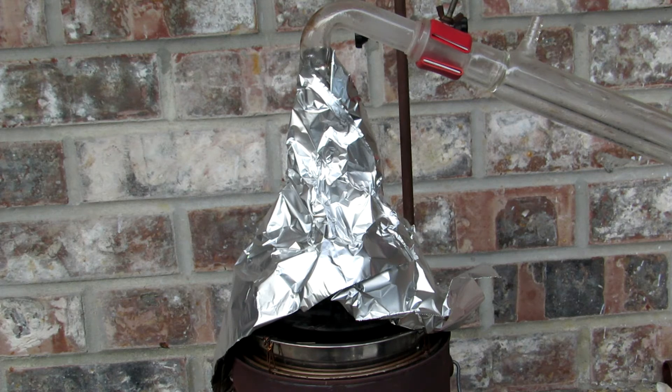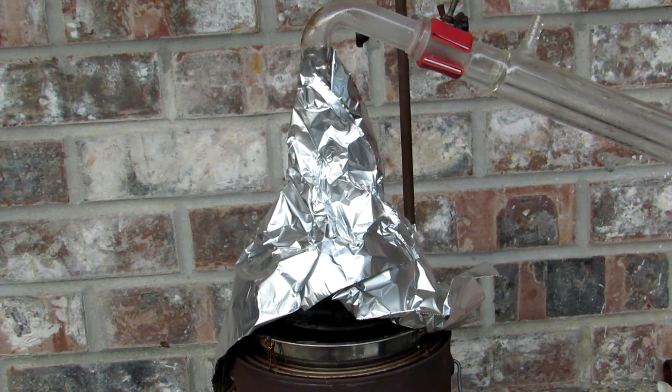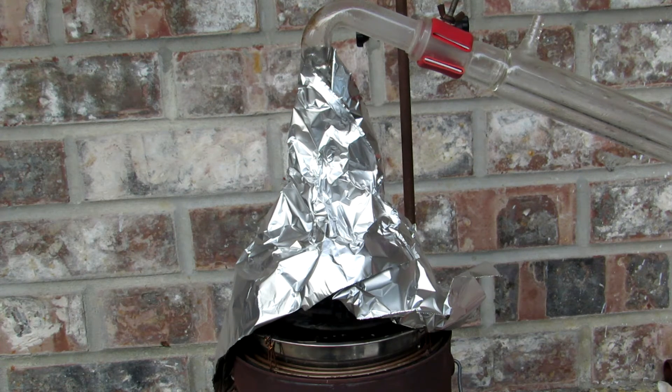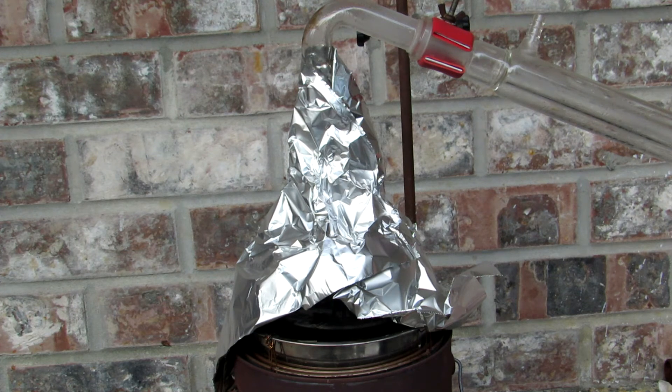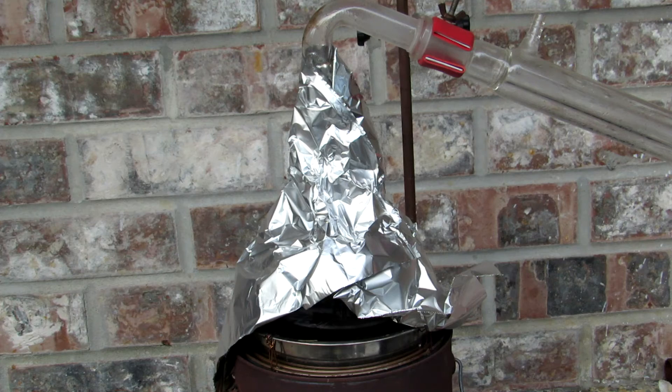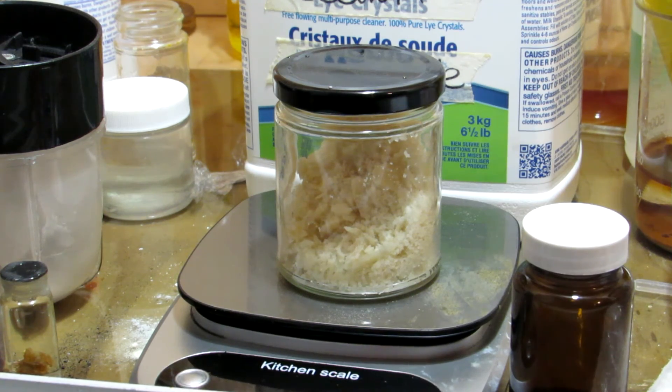Once again I used an air condenser. All of the acetamide was distilled over at approximately 200 degrees Celsius and collected in a round-bottom flask. Before the acetamide could cool I poured it onto a large baking pan so it would cool there and not get stuck in the flask. I then crumbled the acetamide off the pan and in the end obtained 61 grams of acetamide.